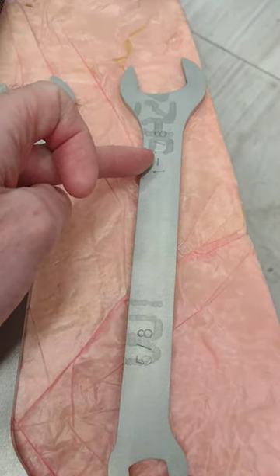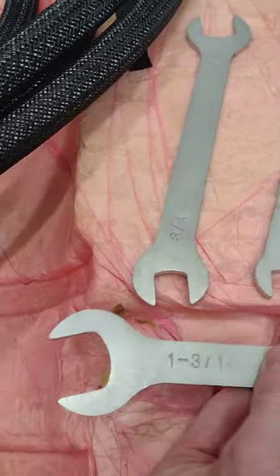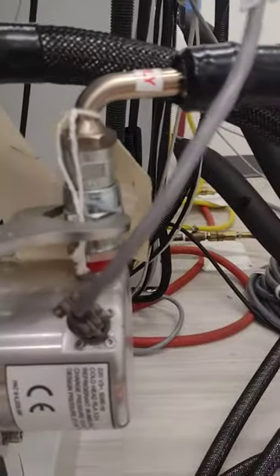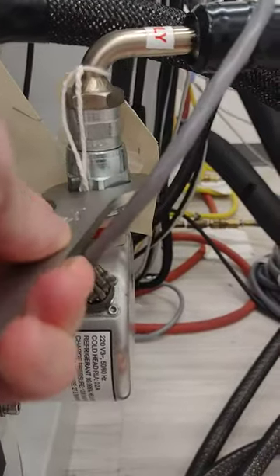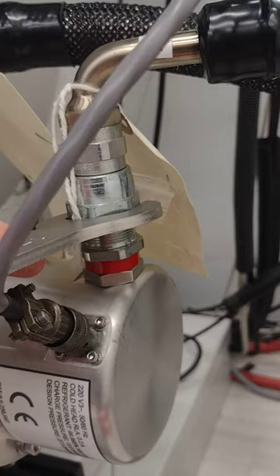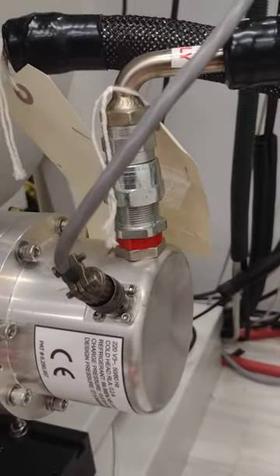We've also got the 1 and 1/8" wrench and the 1" wrench. The first and most important one is the 1 and 3/16" wrench — that's going to go onto this big nut here. This is the connector for the hose, and this is where the special valve is that will block the gas from leaking out.